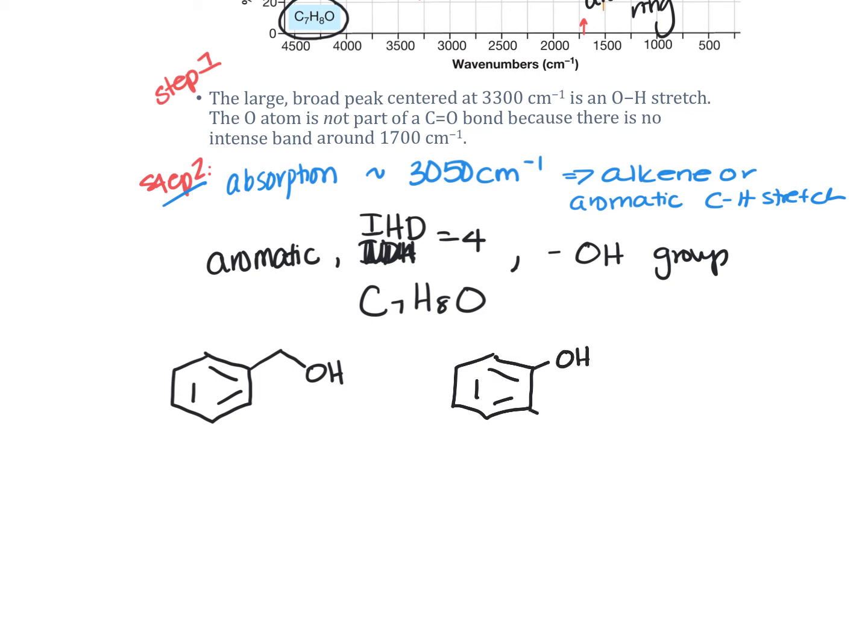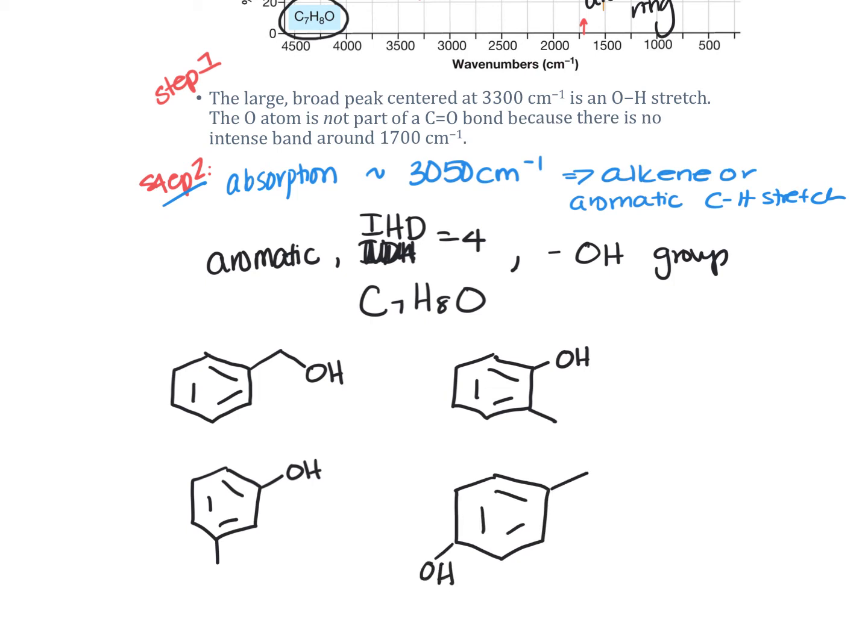It could be this molecule, right? That also fits. It could be this molecule. That also fits. It could be that molecule. So it could be any of these 4 molecules. That's as much as we can get from our spectra.